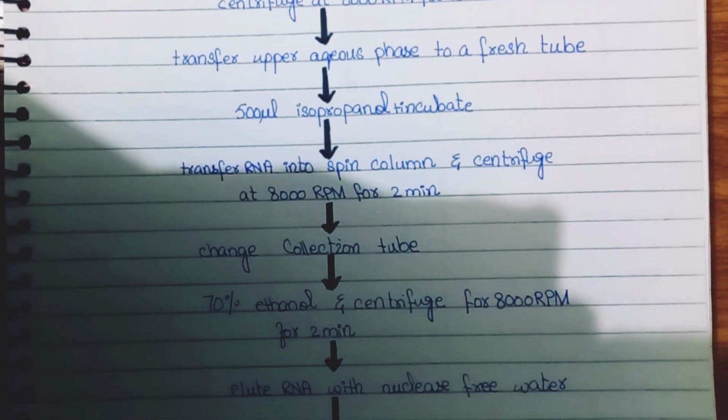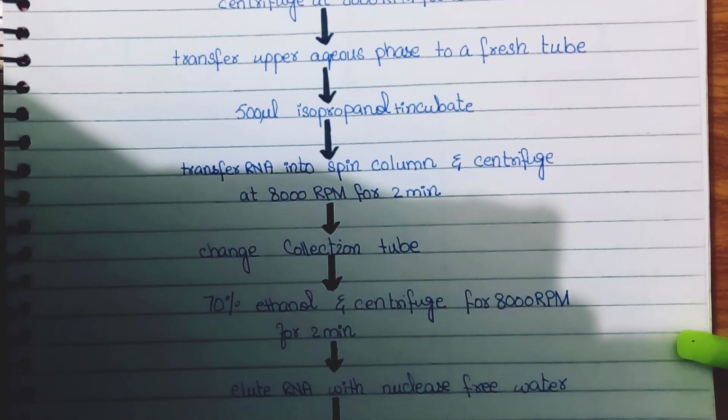Then after that, precipitation, washing with 70% ethanol, and then for elution we will add RNase free water or nuclease free water. After elution, RNA is stored at -20°C.